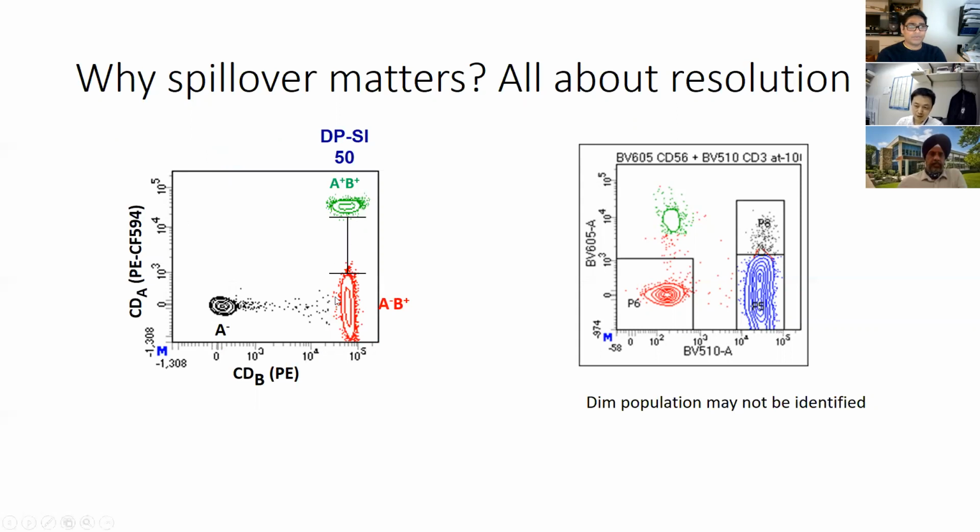But if we do a compensation, of course, this is a good compensation. We can tell because the mean fluorescence looks like it matches the levels. Because this spread, this separation is decreased compared to the one we just did with one color.